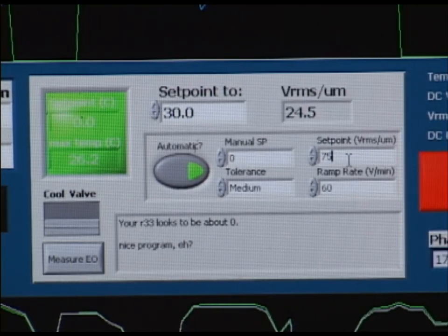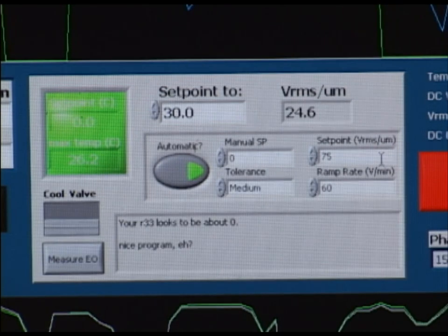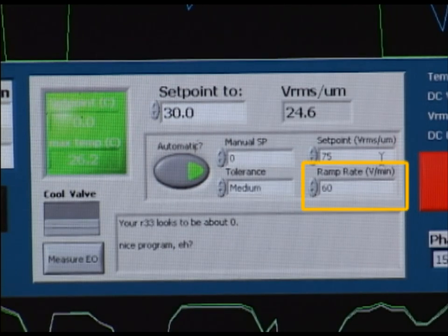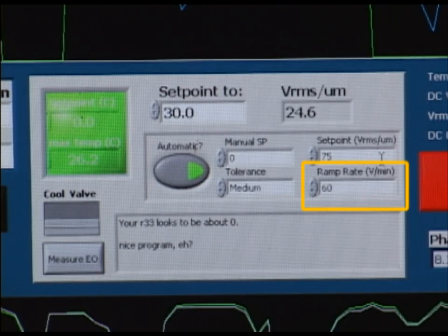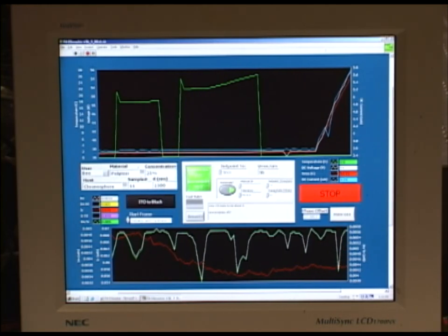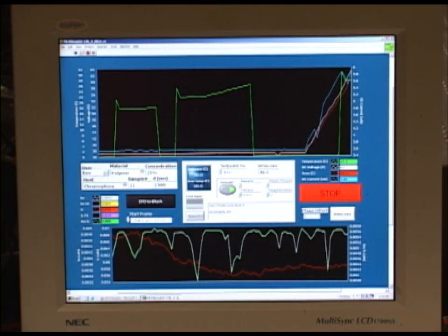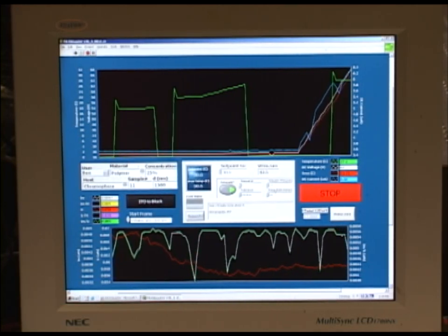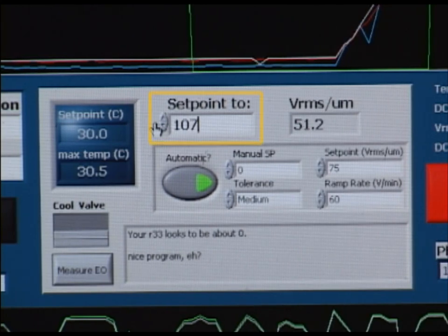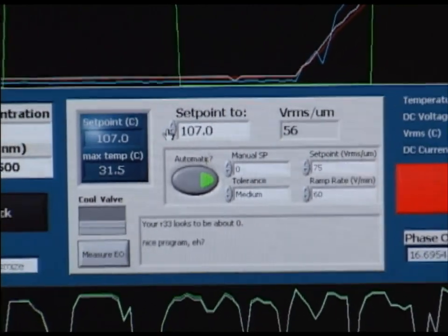Once that value is entered the high voltage source will begin ramping to the desired voltage. We can adjust this ramp rate here in the box just below the set point labeled ramp rate, and this is in volts per minute. Generally we leave this at 60; if we decide to ramp faster we may double or triple it. We'll also want to set the desired temperature for the material. We want to ramp the temperature linearly to the Tg point for that particular polymer that we're using, and we do this by inputting the set point into this box here labeled setpoint to. In this case I'm going to select 107 degrees Celsius.